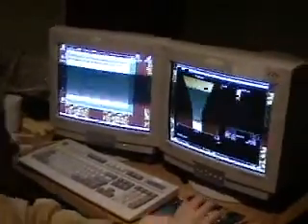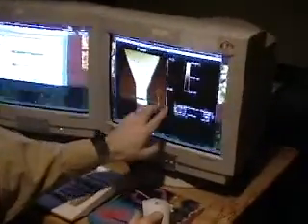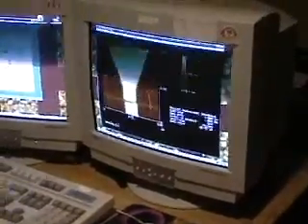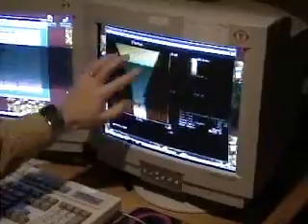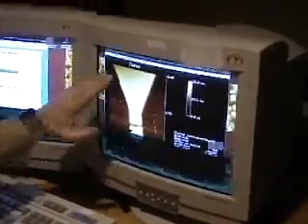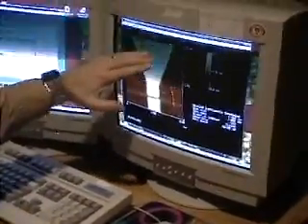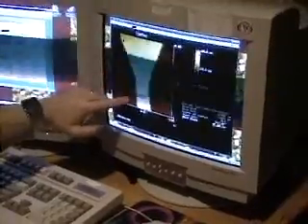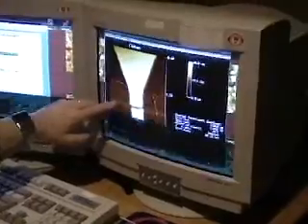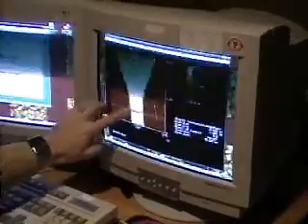subtraction on it. You can see, if you zoom in here, that there is a bright line right across here. That is completely an artifact of the flattening process, because I've got a high part of my sample here and a high part here, and there's a gap in between. The flatten process, which does this line by line plane fitting, adjusts every line to have the same average value, and so it's going to boost the values here so that they have the same average as the rest of the image, and that's why this appears lighter.